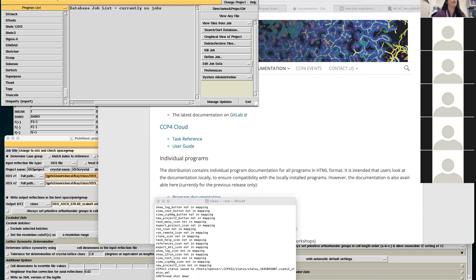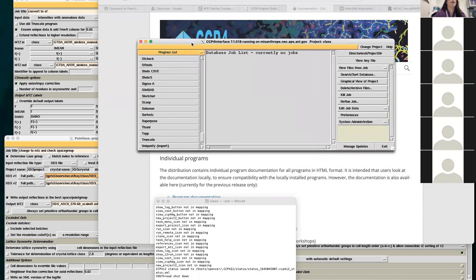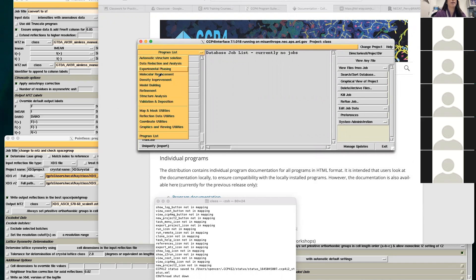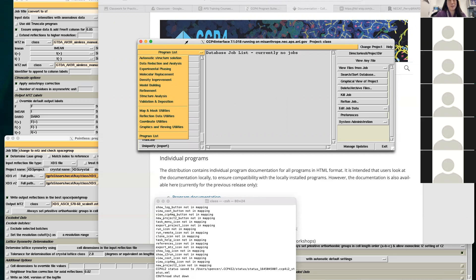In CCP4, they have everything divided into tasks, as well as a catch-all generic program list. What the CCP4I interface does is it writes the script files you would use to run the jobs — it makes series of scripts, streamlines everything, and lets you just fill in boxes and point and click.